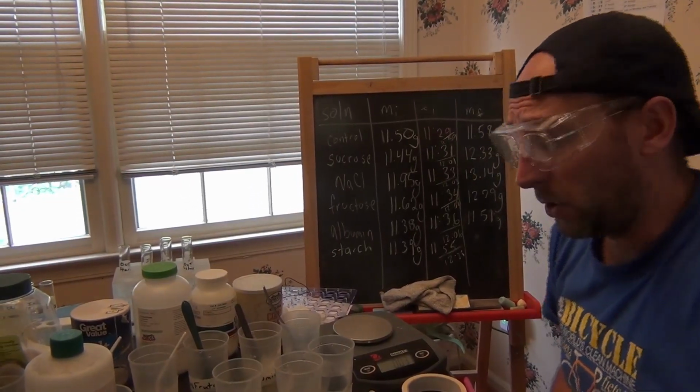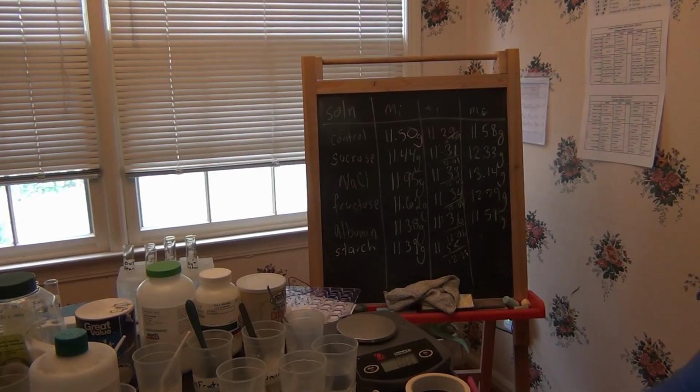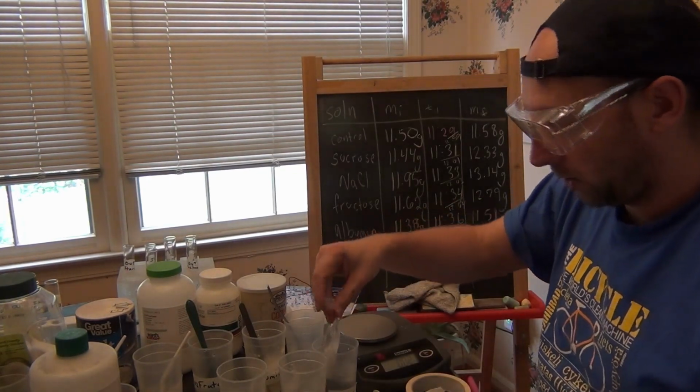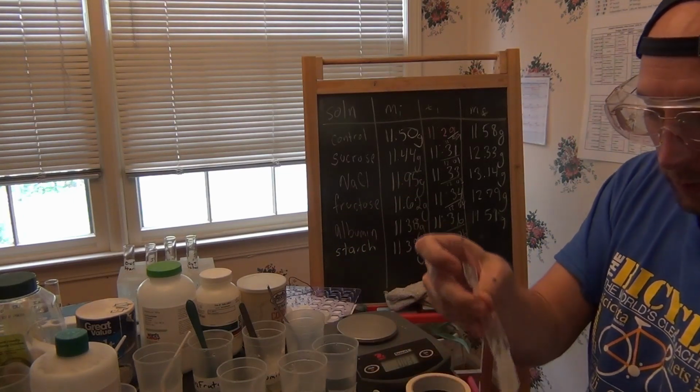It's time for the starch. We're going to test what the starch is on the outside. Under dry paper towel.